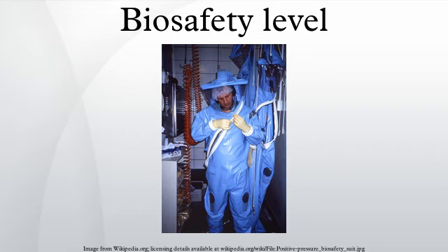A biosafety level is the level of the biocontainment precautions required to isolate dangerous biological agents in an enclosed facility. The levels of containment range from the lowest biosafety level 1 to the highest at level 4. In the United States, the Centers for Disease Control and Prevention have specified these levels. In the European Union, the same biosafety levels are defined in a directive.